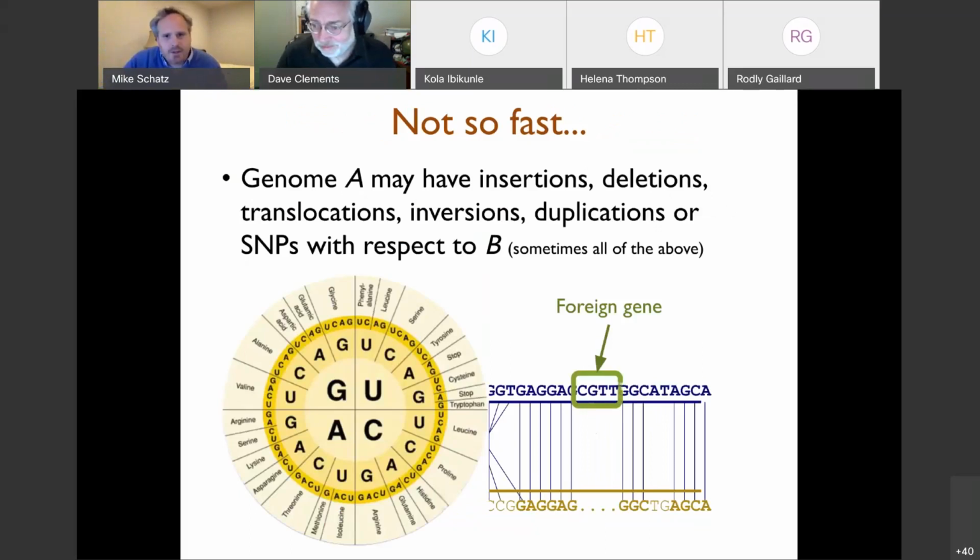And then what we're going to do is look for gene sequences inside of that novel insertion, where we can decode the codons from nucleotide sequences into amino acid sequences, to look at the protein sequence that is associated with this novel insertion. If all is going well, hopefully there'll be a really interesting protein sequence to be discovered there.